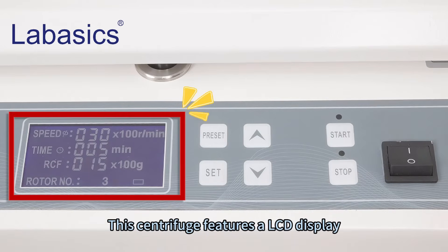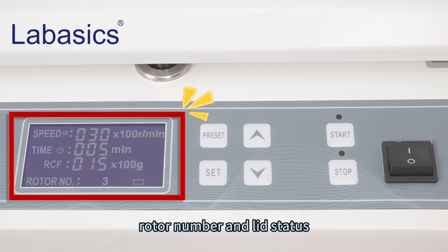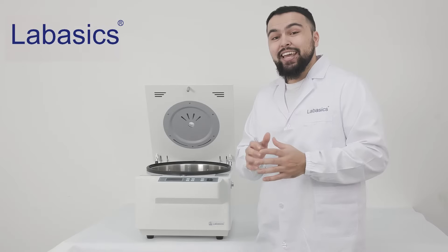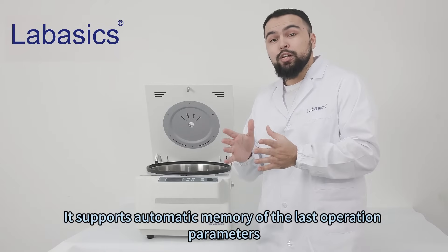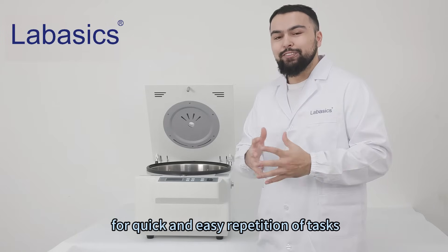This centrifuge features an LCD display that shows the speed, time, centrifugal force, rotor number, and load status. It supports automated memory of the last operation parameters for quick and easy repetition of tasks.